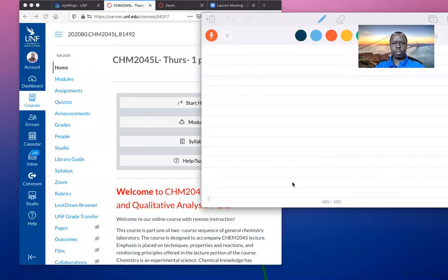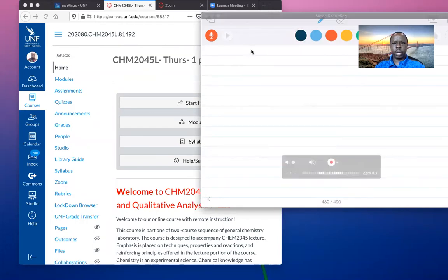This experiment, it is a simulation. It is not in the lab manual, but I do have the handout on Canvas, which you can easily download. Let me just share my screen here, and I'll walk you through the experiment, what you need to do, what you need to record, and where to get the data sheet.